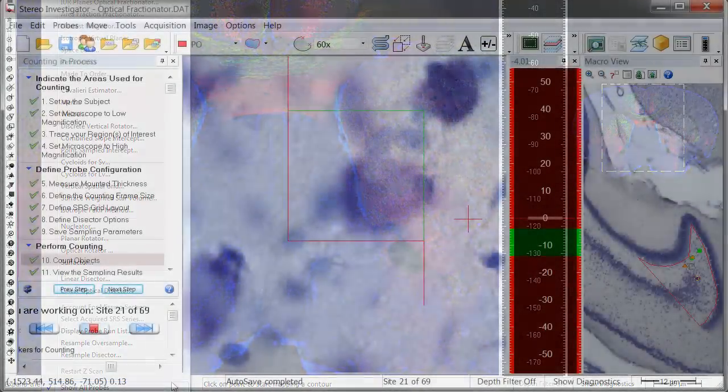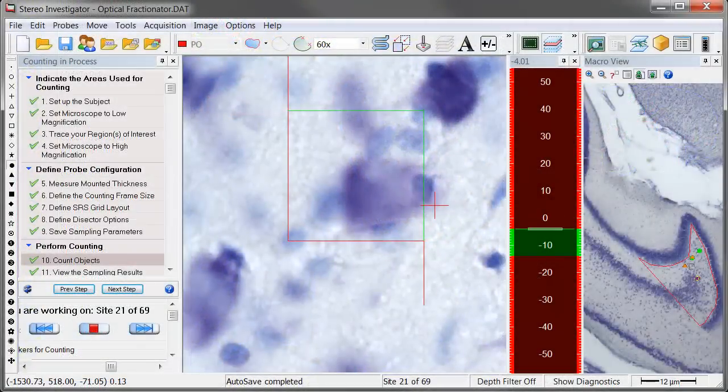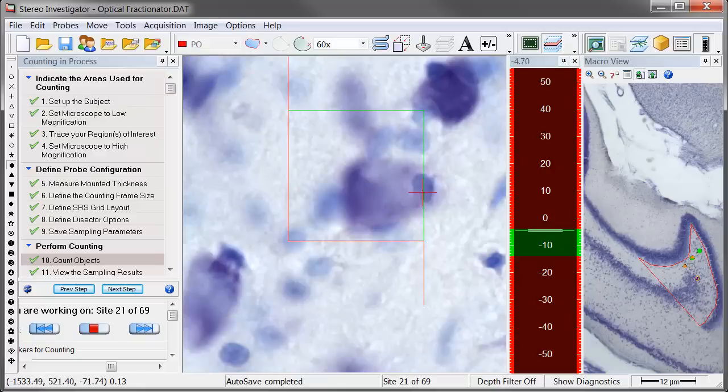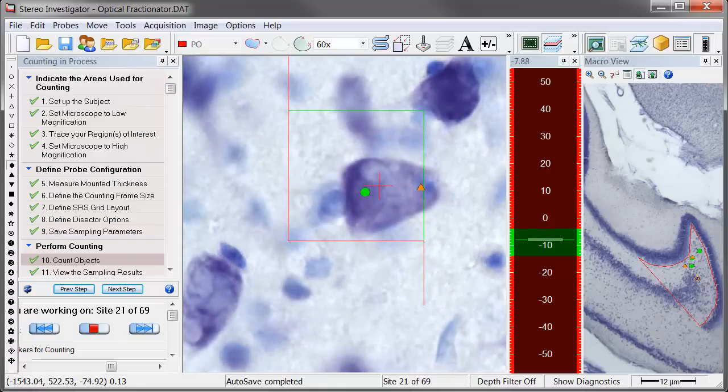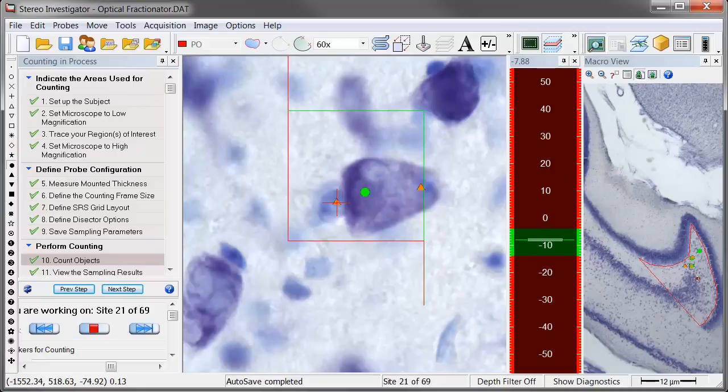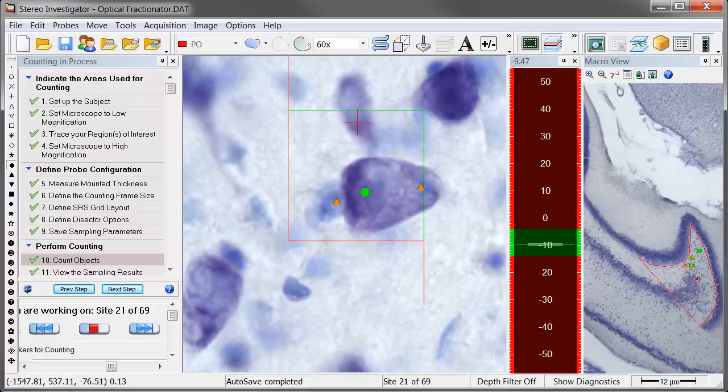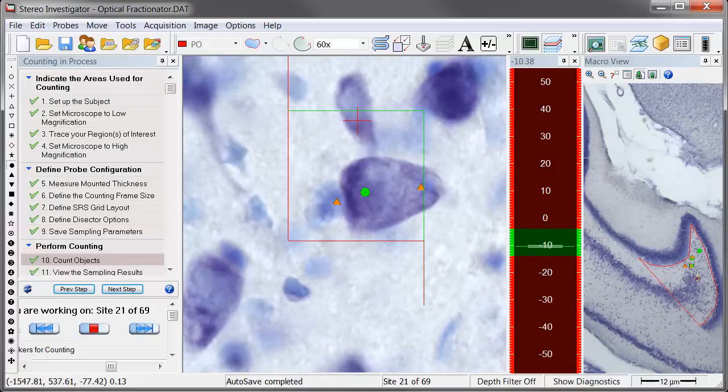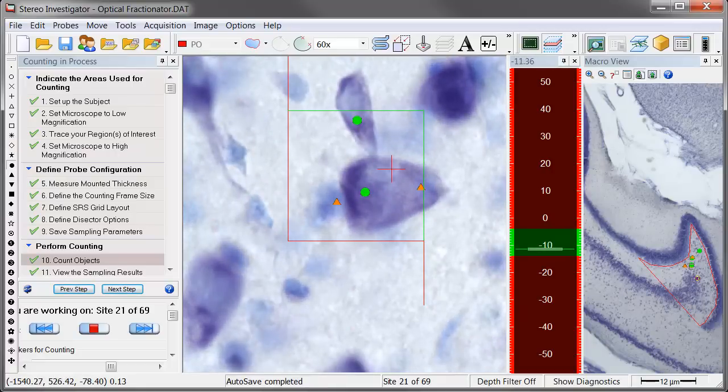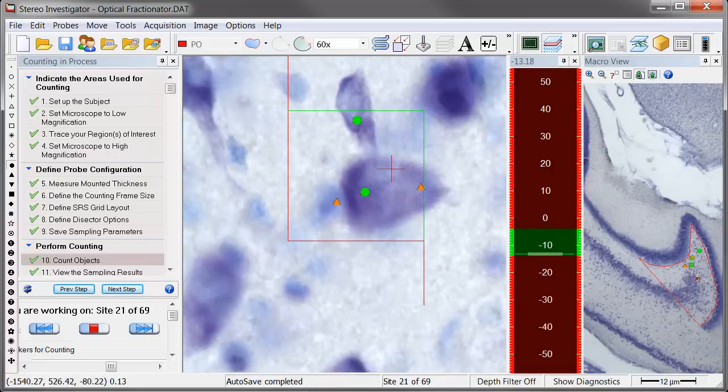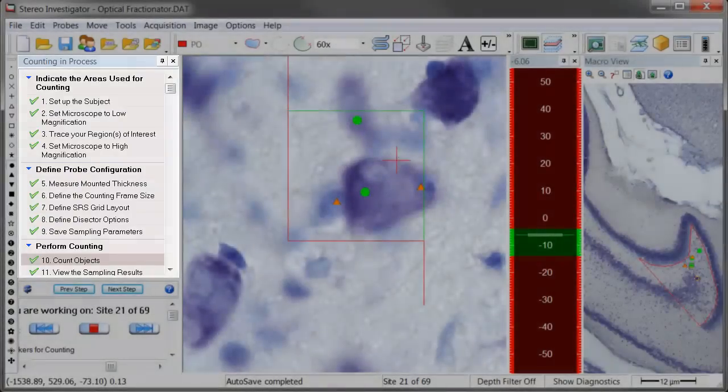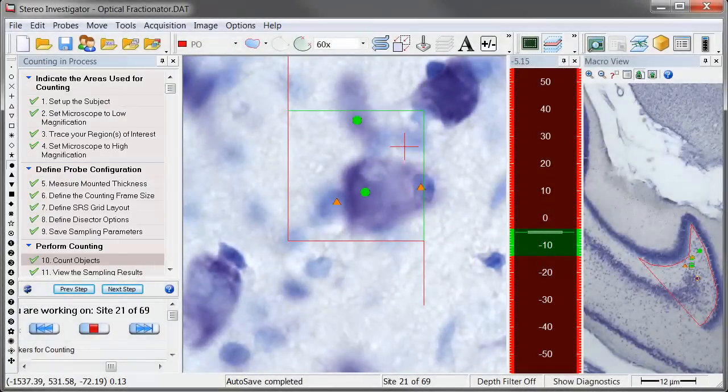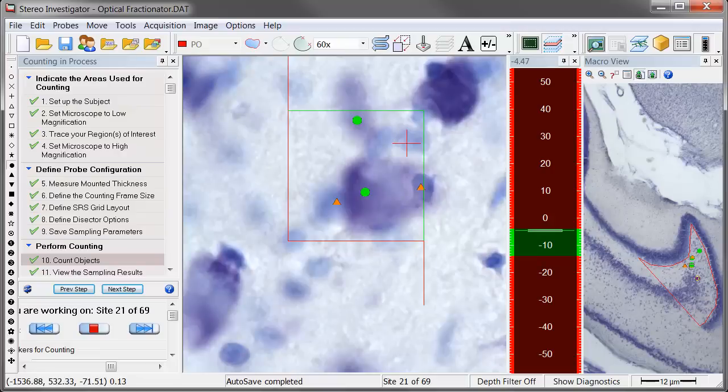We'll start with the optical fractionator. The optical fractionator is a stereological probe used to estimate the number of objects in any three-dimensional region, regardless of the object's size, shape, or orientation.